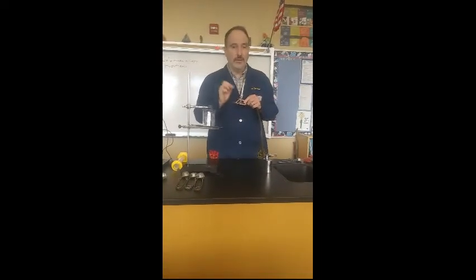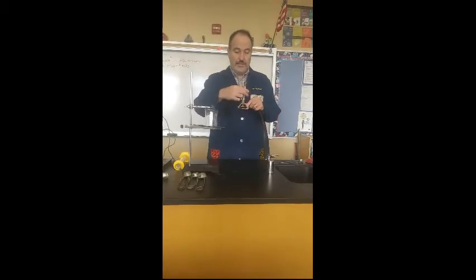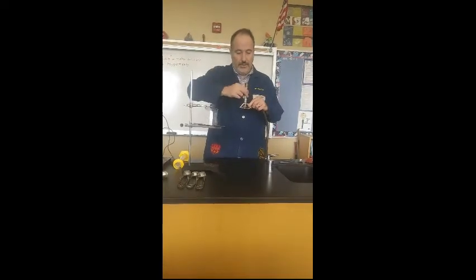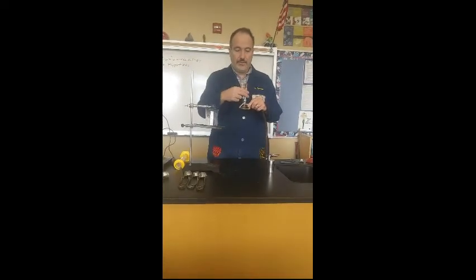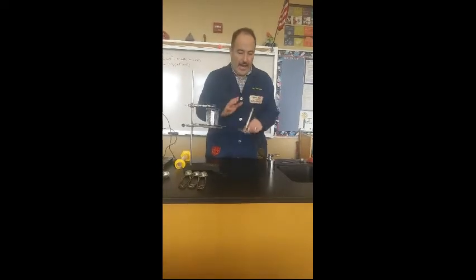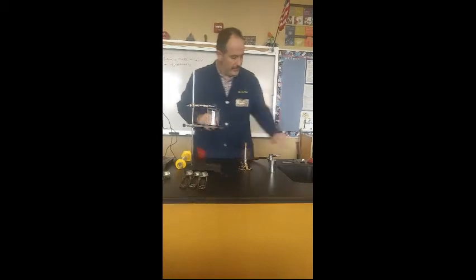Next, you want to make sure that the air vents are all the way closed. It makes lighting it so much easier, okay? So you just go and you turn the barrel like you're closing a lid on a jar, and you just twist, twist, twist until it won't twist anymore, okay? And you don't have to tighten it, you just want to close it.